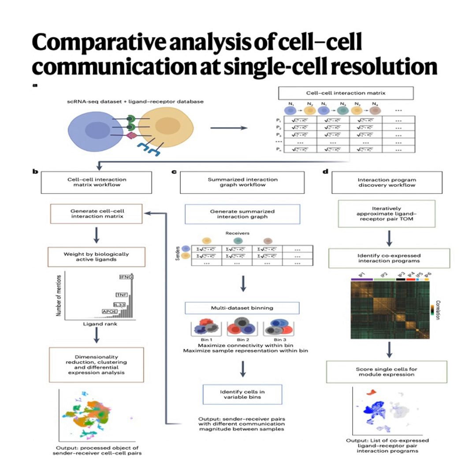It gives you structure and insight into huge data sets without needing that full initial CCIM. Okay, this is where it gets really interesting, the payoff. We've talked about the how, the mechanics of CCIM, binning, and IPs. Now let's see the why. What actual biology did this single-cell approach uncover that the older aggregate methods were missing?